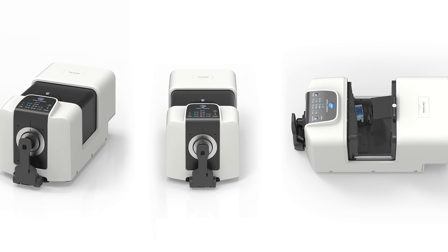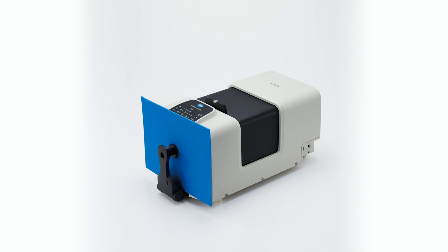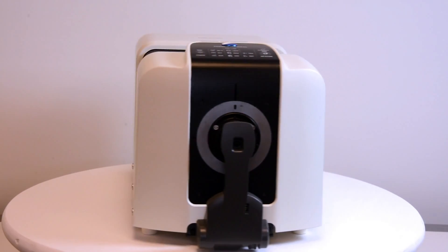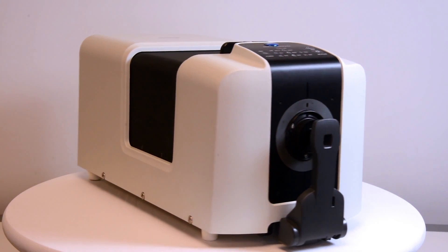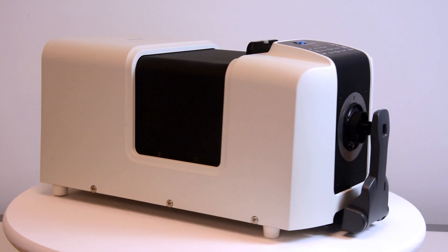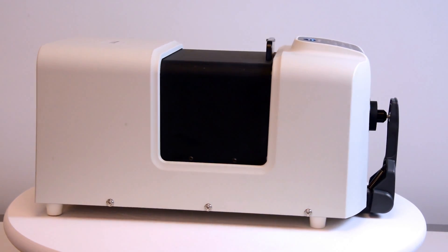The new CM36DG provides the stability and reliability that users have come to expect from Konica Minolta Sensing. With the addition of new exciting technology, the CM36DG offers resounding solutions for the increasing demand in the world of color measurement.